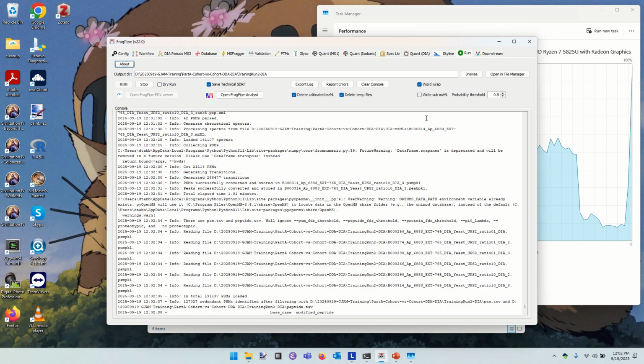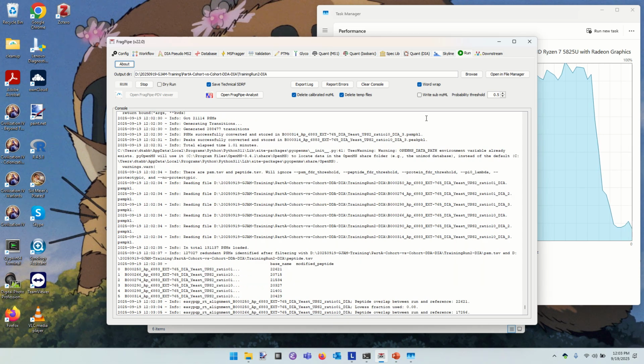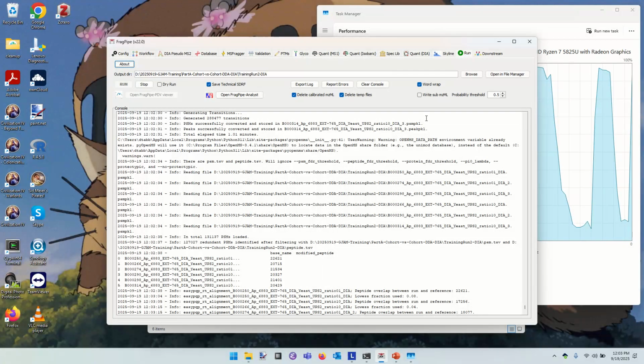Merging file or which step? It still has not exported the spectral library. Okay. It's just taking its own sweet time to get there. I need to update my laptop again. Thanks. Have a nice day. Thanks. Well, for those listening to the recording, I'm still here, and we will sit through until this starts the quantification step, at least.